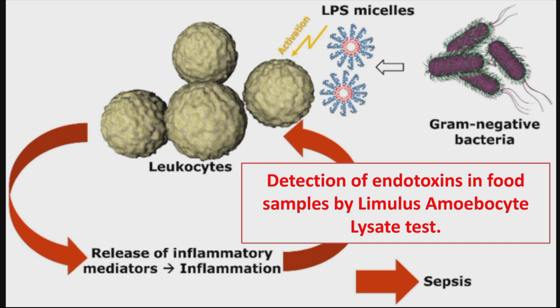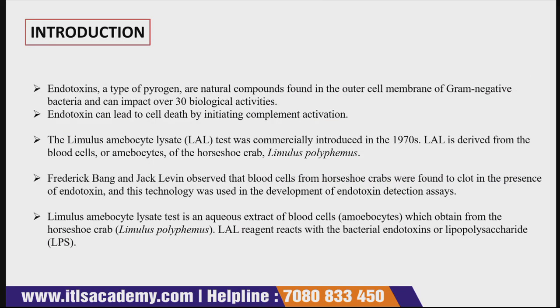So today in this lecture we are going to study the detection of endotoxins in food samples by the Limulus Amoebocyte Lysate test. In this particular lecture we will study how you detect endotoxins in a food sample. Before understanding this whole experiment, let us understand what endotoxins mean.